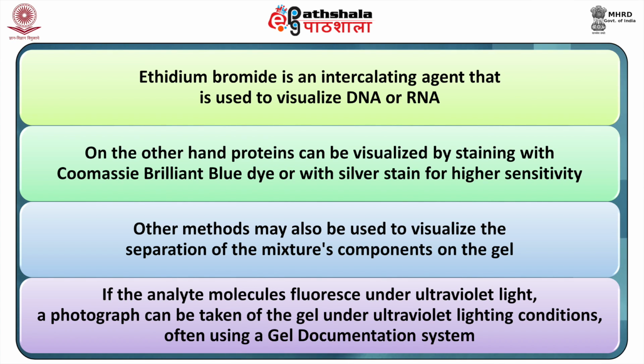If the analyte molecules fluoresce under ultraviolet light, a photograph can be taken of the gel under ultraviolet lighting conditions, often using a gel documentation system. If the molecules to be separated contain radioactivity added for visibility, an autoradiogram can be recorded of the gel.